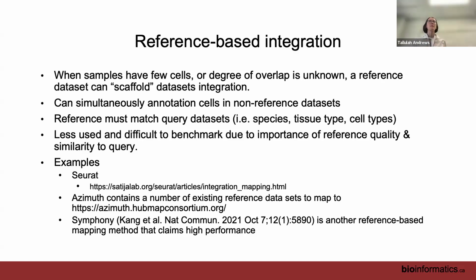Is it using another reference control or just using one set of our samples as a control, then just change the other one? Yeah, so the question is whether we're using an external reference or using one of our samples. So it can be either. So most often this is using an external reference, but for certain people and certain projects, they also actually use an internal reference. So maybe they did a bunch of samples at one point in time that were really good, and then they build on top of that and add more samples to that project.